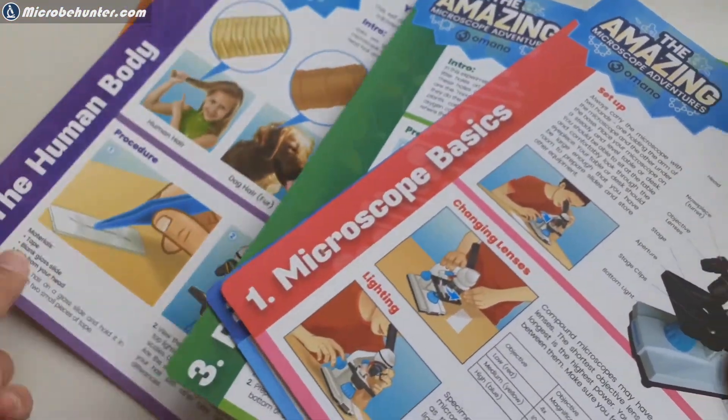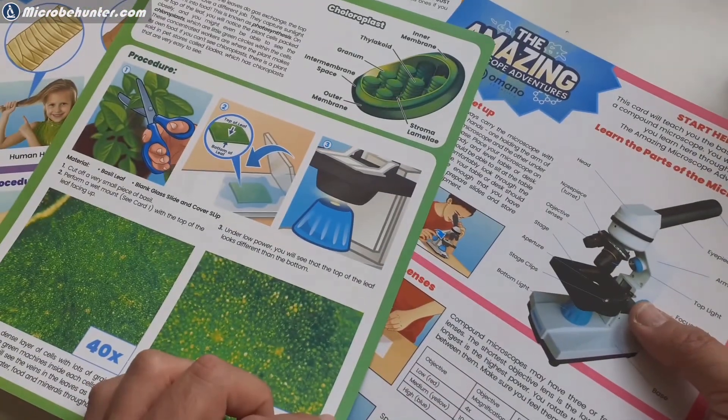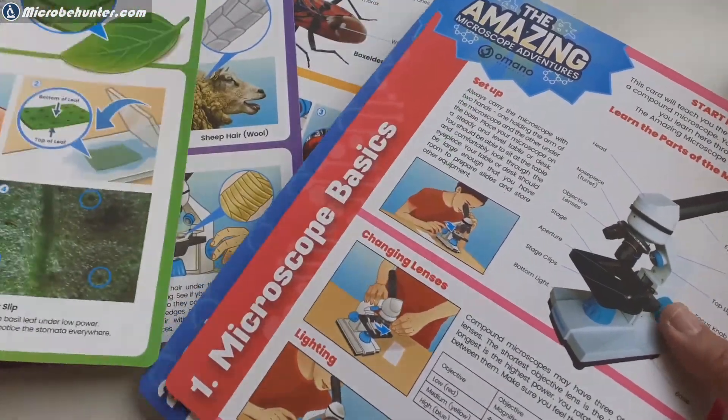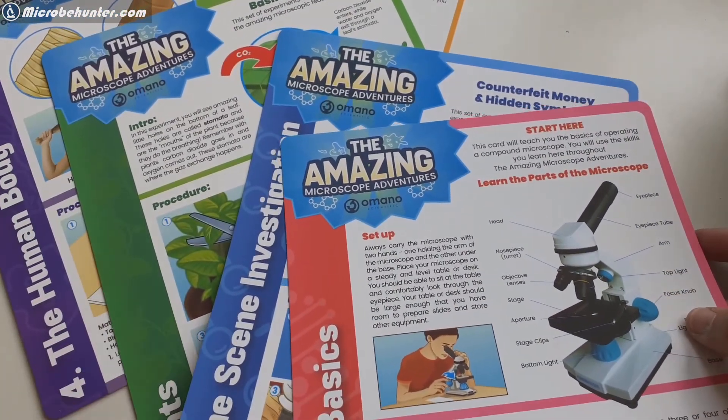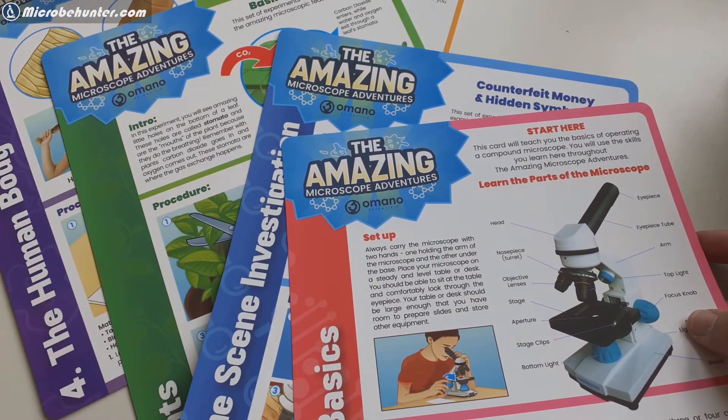It basically explained front and back the different activities that can be done. Of course for me being a teacher in my non microscopy life so to say I teach biology. It's of course also quite interesting.